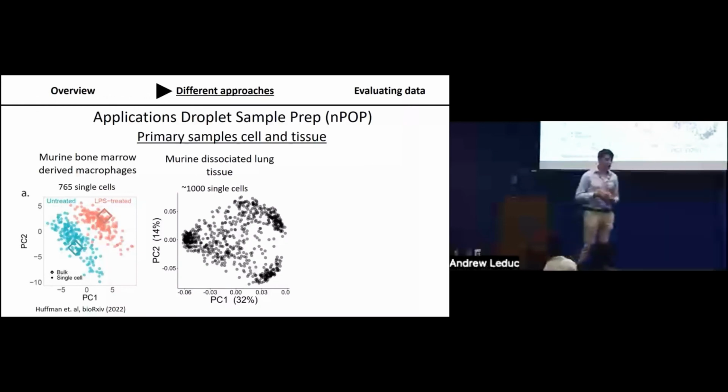To the extent that there are systematic biases in all the measurements that we make, whether it be co-isolation from DDA or interferences from DIA, if you're doing studies that rely heavily on quantitatively accurate measurements, comparing these two measurements can be a really nice additional orthogonal way to compare the accuracy of your data. And to the extent they agree, they can provide you with a higher level of confidence and give you more power to say certain things and have confidence in your data. So yeah, that's a great suggestion. We've done limited work comparing this so far, but hopefully plan to.